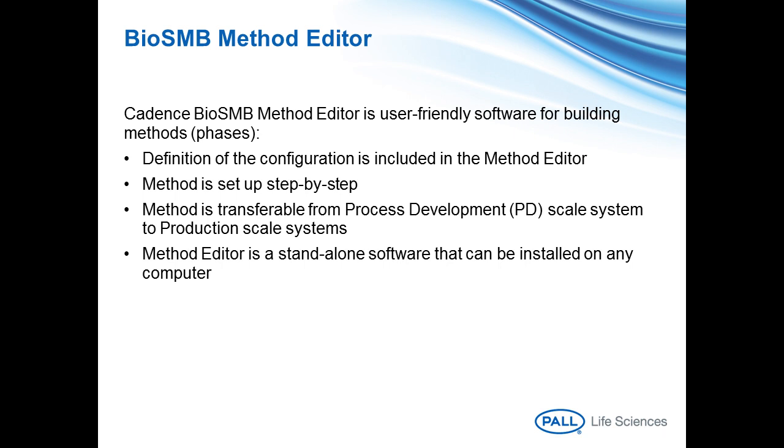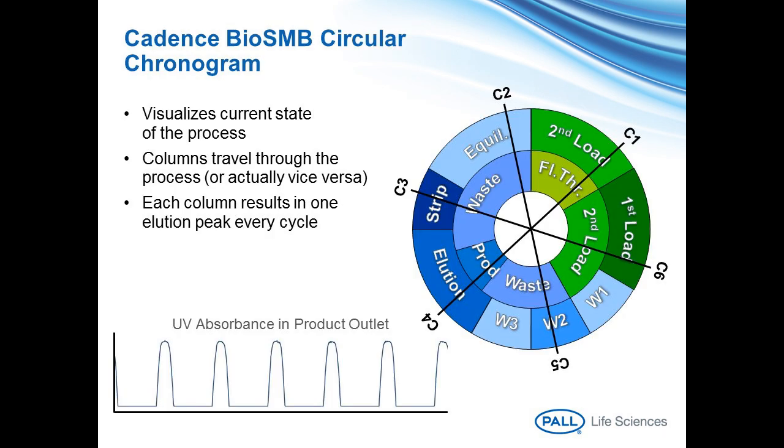The method editor is also a standalone piece of software that you can install on your notebook or your desktop computer, so you do not necessarily have to program your method on the system or in the lab.